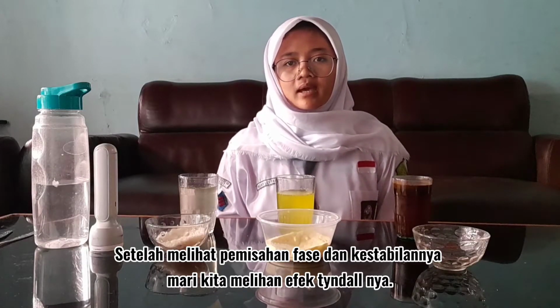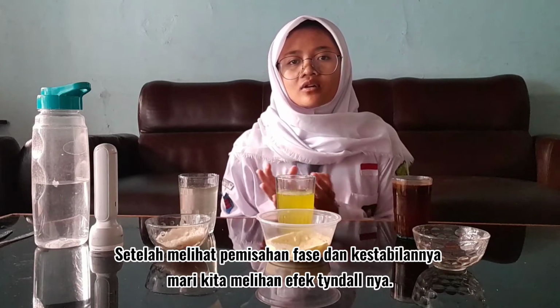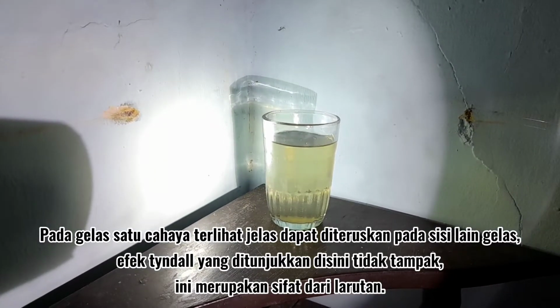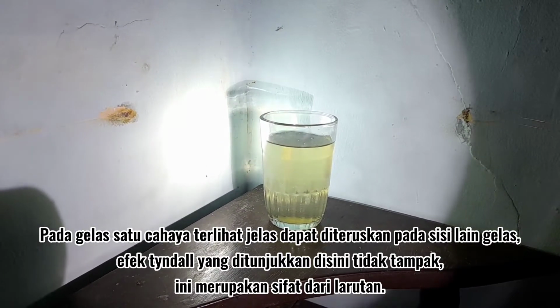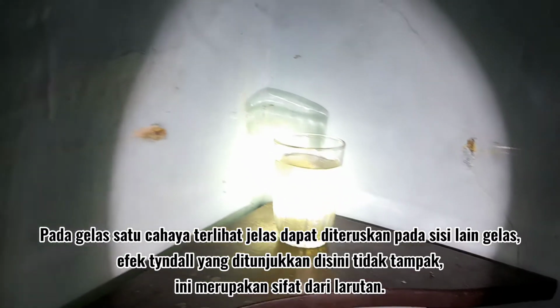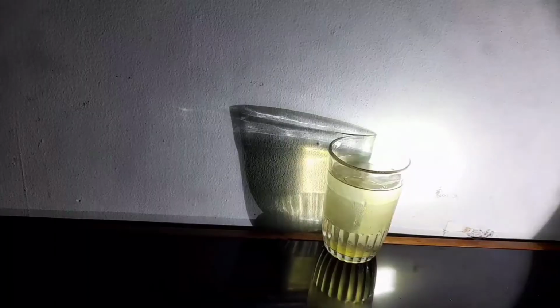After observing the phase separation and stability, let's take a look at the Tyndall effect. In glass 1, the light clearly continues to the other side of the glass. The Tyndall effect is not visible here. This is the nature of a solution.